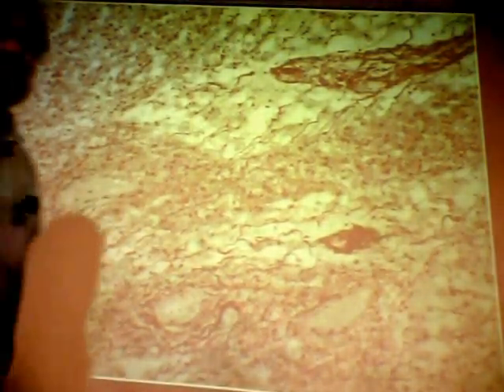Dr. Harrison, do you have any blood slides? No, because I'd have to put them on oil immersion to really see them, and that's a hassle. I'm not going to put the blood cells on. But if you want to look at your scope, I'd be glad to identify them for you.